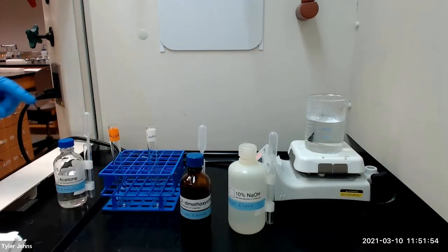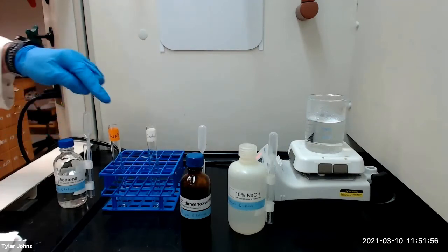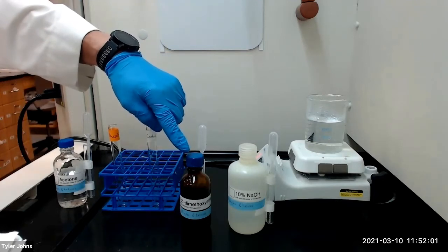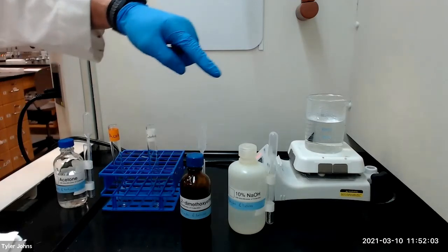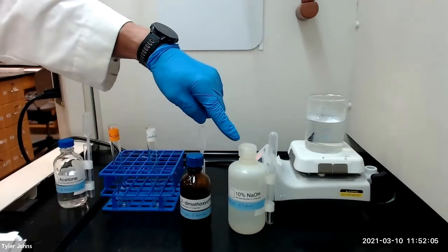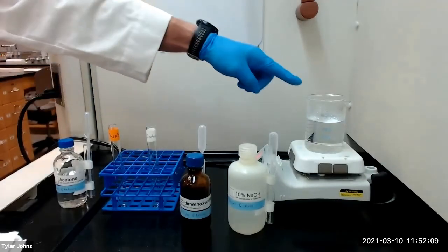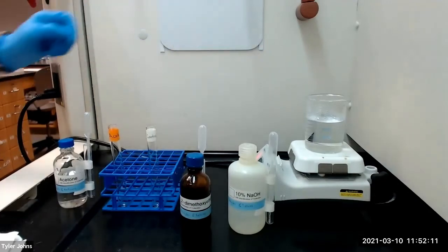We will begin by adding a small amount of acetone to a test tube and then dissolving the acetone in two milliliters of 1,2-dimethoxyethane. We will then add two milliliters of 10% sodium hydroxide solution and place the test tubes in a 60 to 70 degrees Celsius hot water bath.